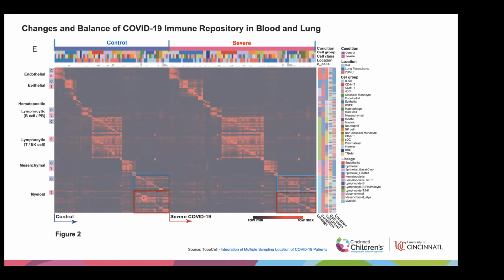Because we compressed them a lot here, and each small chunk contains tens of genes, this is just a global view to pinpoint which part we can focus on. For example, this part, where the signatures in control and in severe are very different.